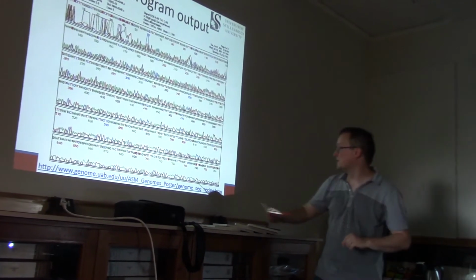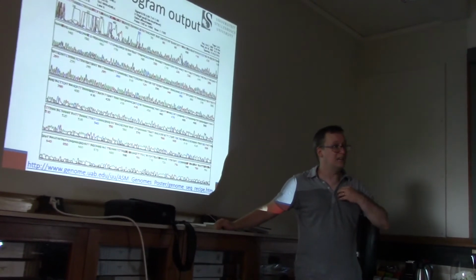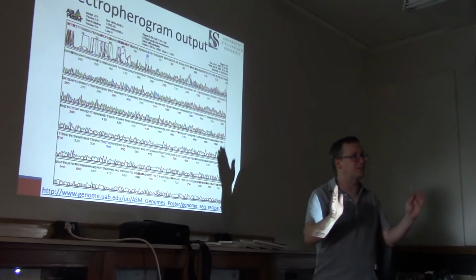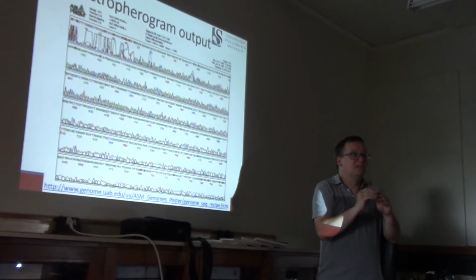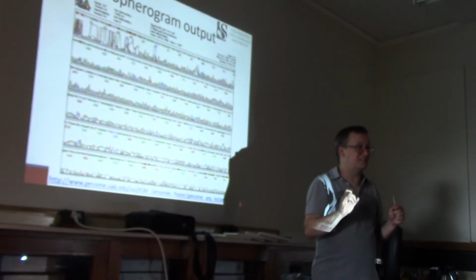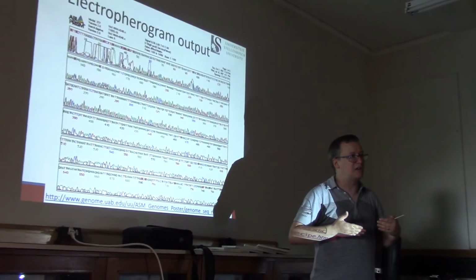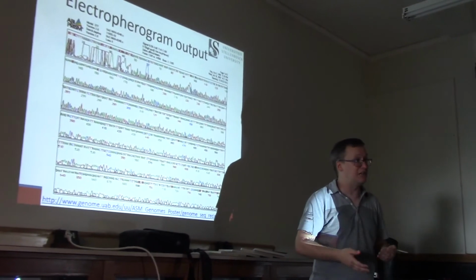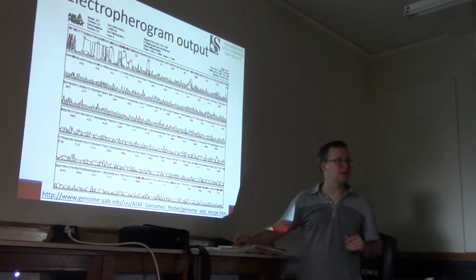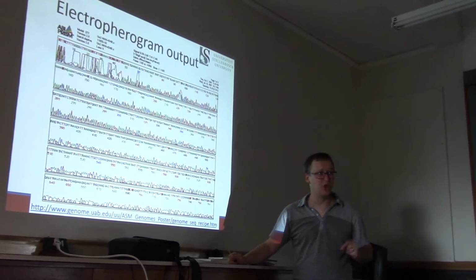So this is something that's pretty much common to all chromatographic methods, that anytime you're doing a separation, your ability to separate these species from each other unambiguously depends on how big they are compared to how big the difference in mass is, or whatever property you're using for separation. As you're separating these nucleotides through capillary electrophoresis, your ability to tell something that's 700 nucleotides in length apart from something with 701 nucleotides is pretty small.